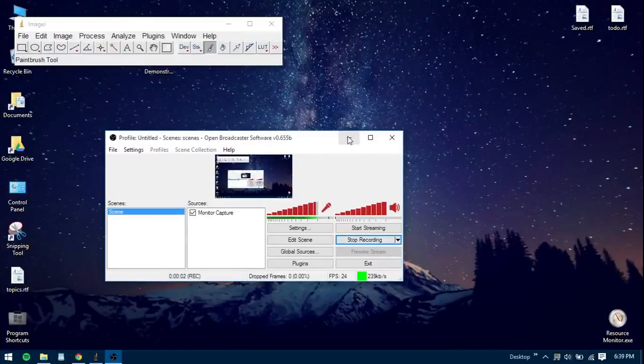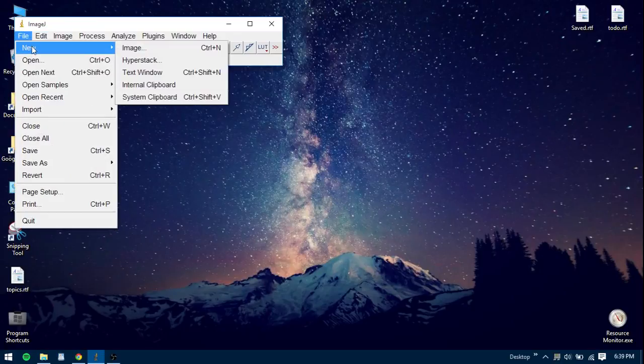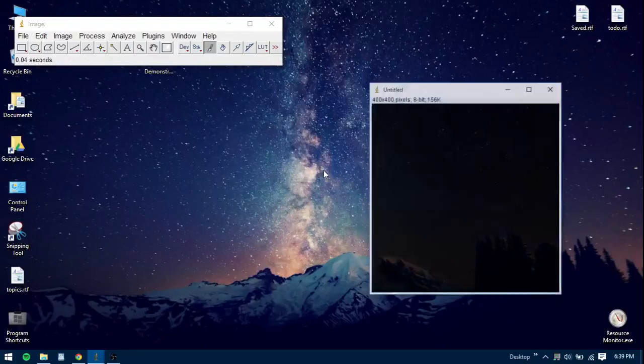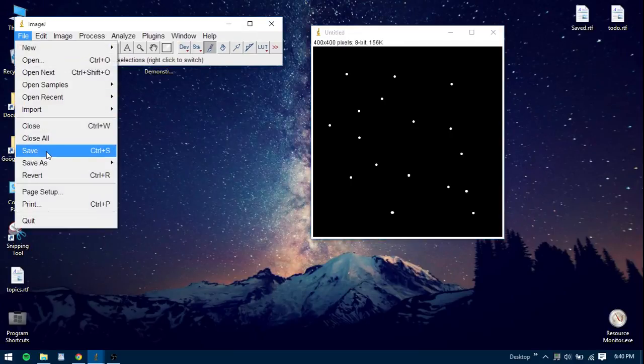If the video suddenly cut off from before, that's because I had made a mistake, so I'm just going to re-record it. Another cool algorithm you can do in binary is Voronoi. So you start with a binary, and let's just say that you have dots over here, white dots, which in your actual binary will be the outlines of cells or nuclei or whatever you want. And the Voronoi algorithm basically demarcates boundaries that are closest to each cell. And that might not make very much sense right now, but I'll show you what I mean in a minute.